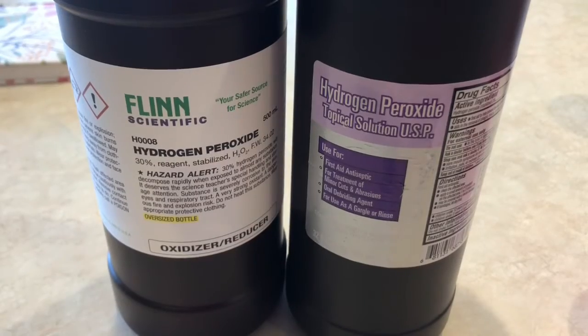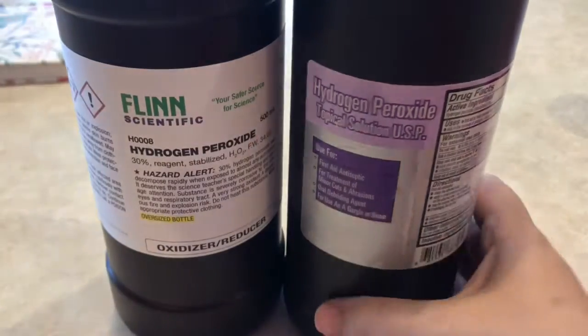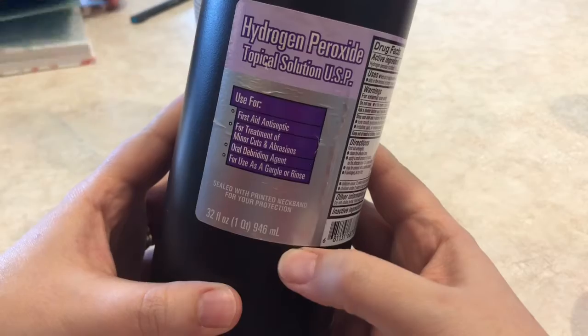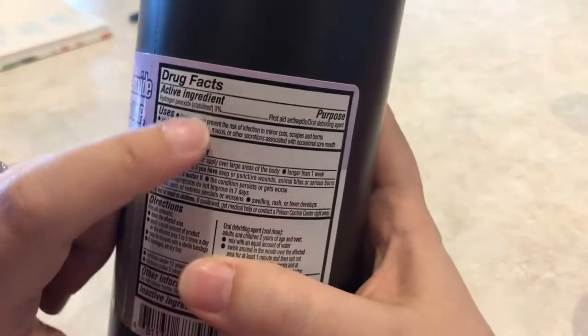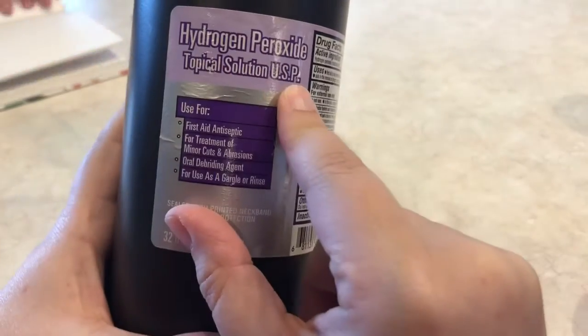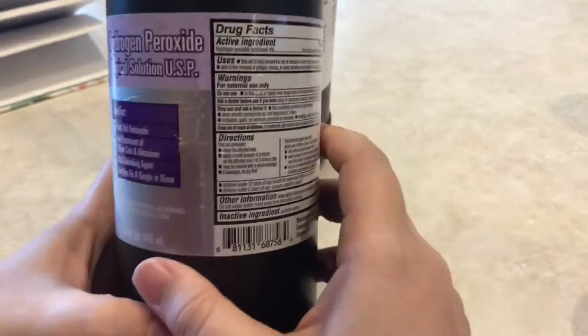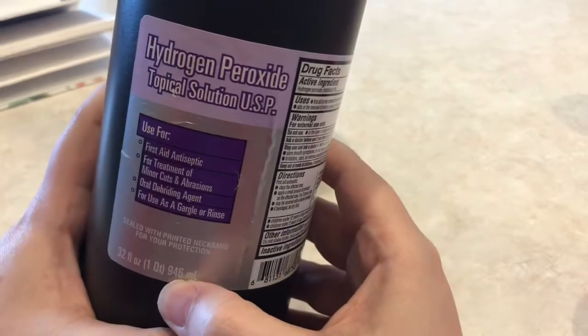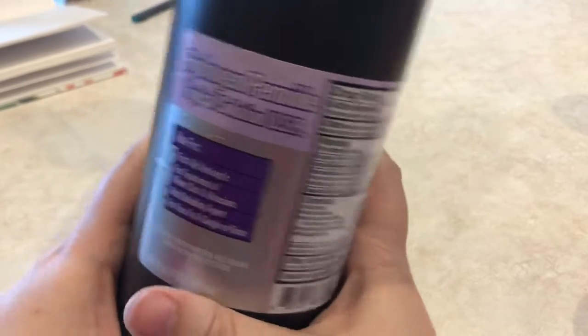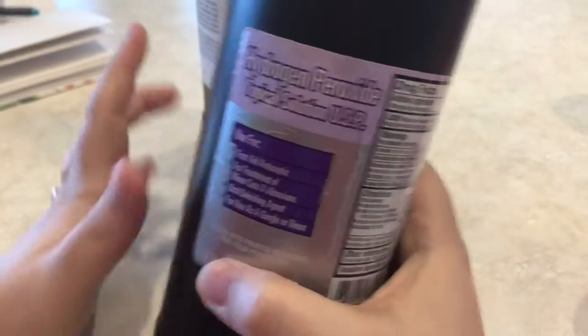The other thing we're going to look at is concentration. So I have 2 different kinds of hydrogen peroxide here. The first one is the kind that you would buy from Walmart or the drugstore, and if you look at the label, it says that it's 3% hydrogen peroxide. So only 3% of what's in here is actually hydrogen peroxide. The rest is just water. This stuff is safe for you to touch and use as first aid, and it's the stuff that you're familiar with.